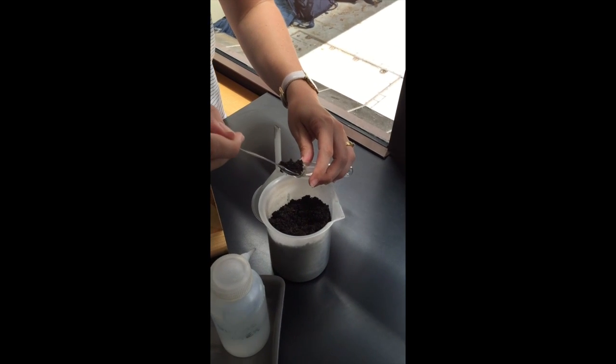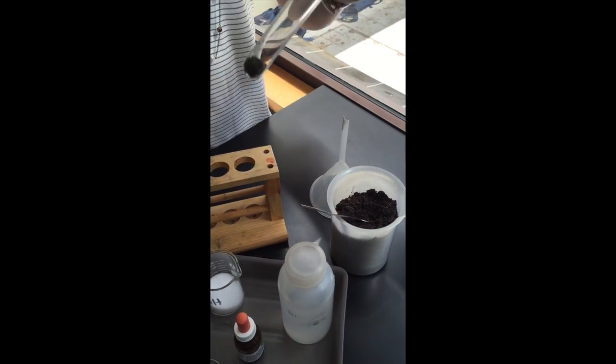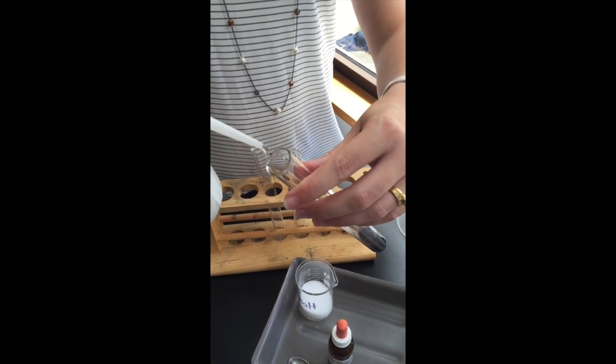The first thing you're going to do is get a little spatula worth of soil and put it into the bottom of a test tube. Then add about half a test tube's worth of water and give it a really good shake to mix it all up.